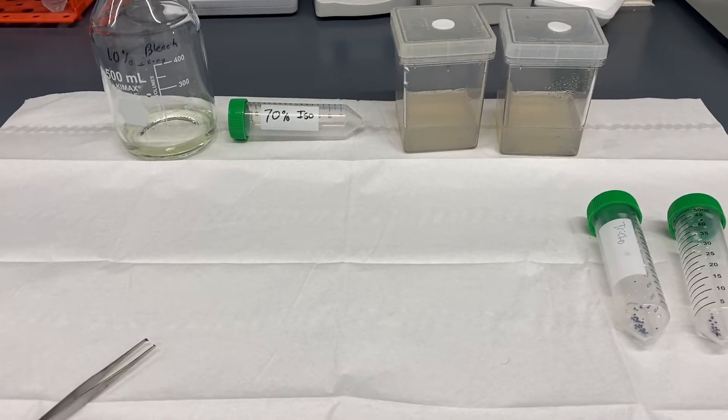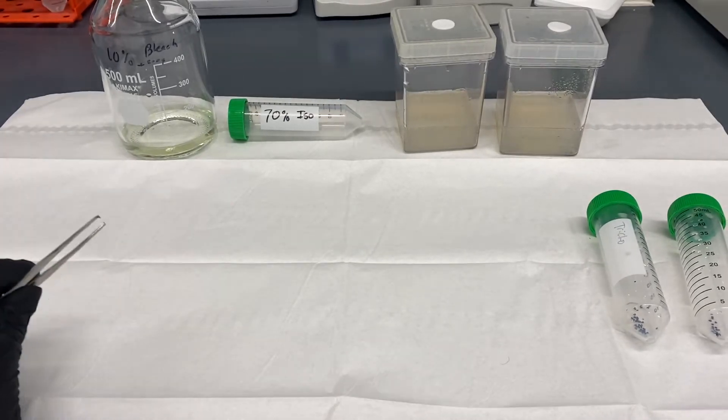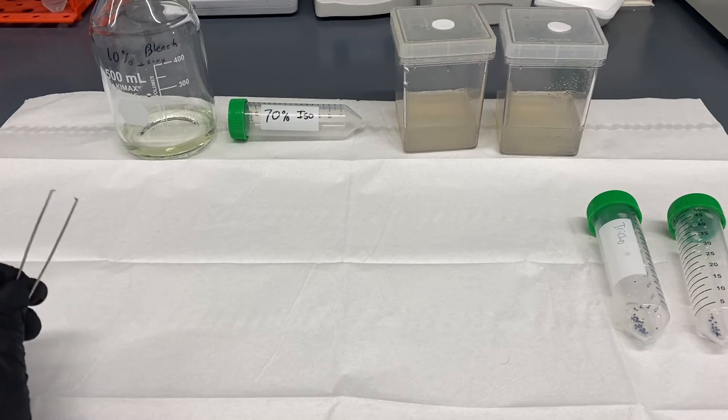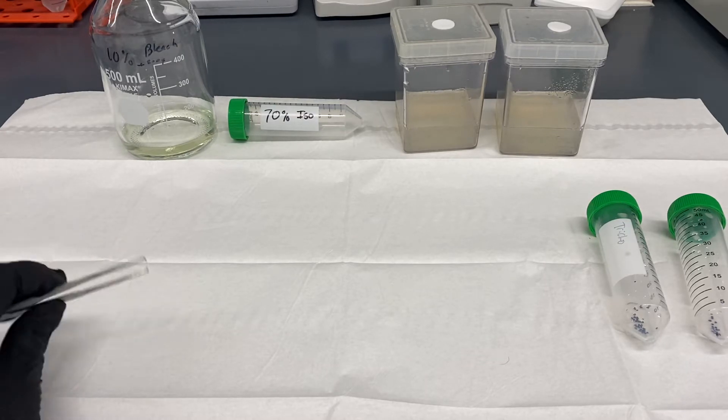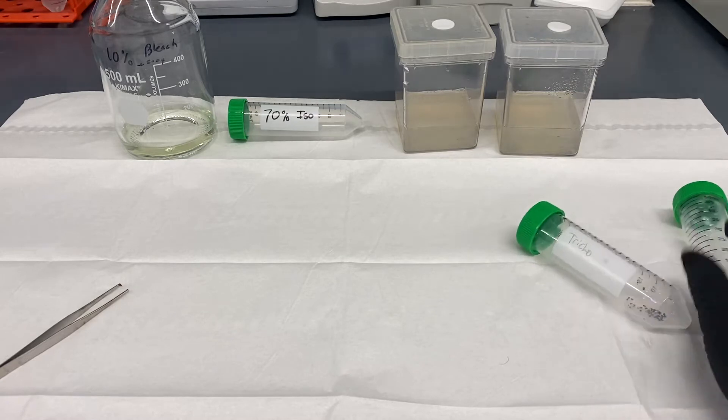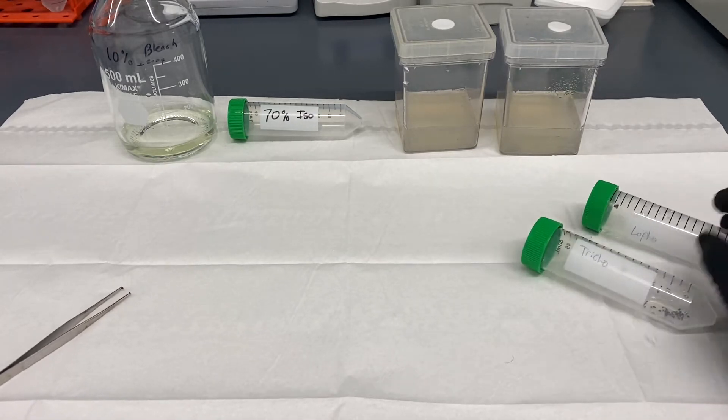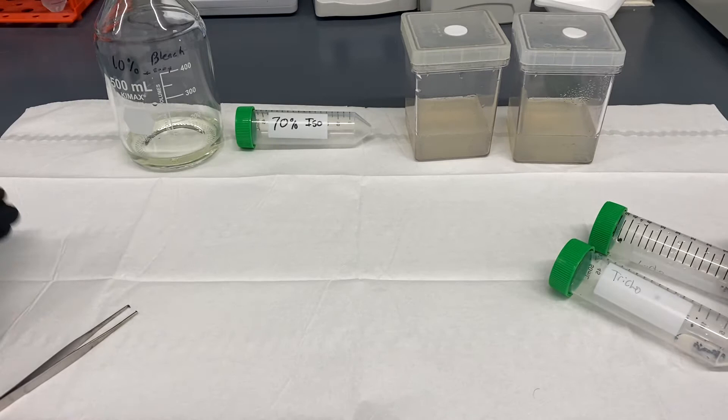Hey, so I just want to do a little introductory video of what is tissue culture and the applications that you can use it for in cactus culture. I'm not really gonna do much but this is just to show you.